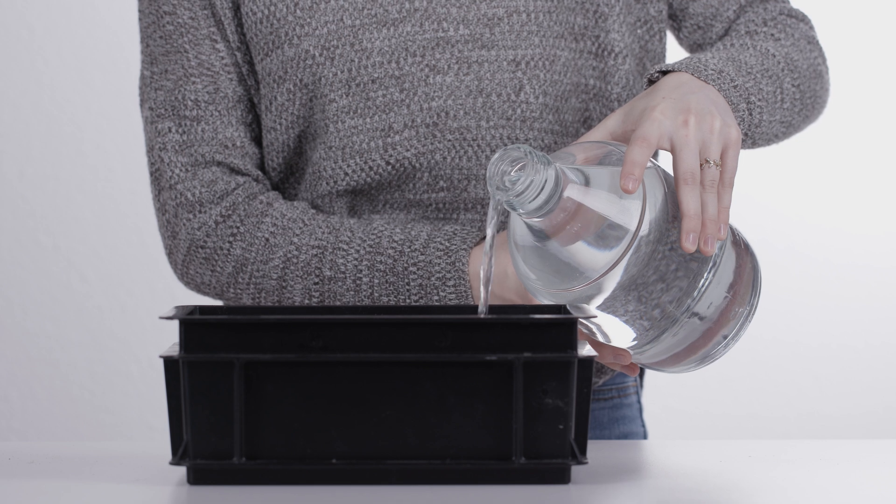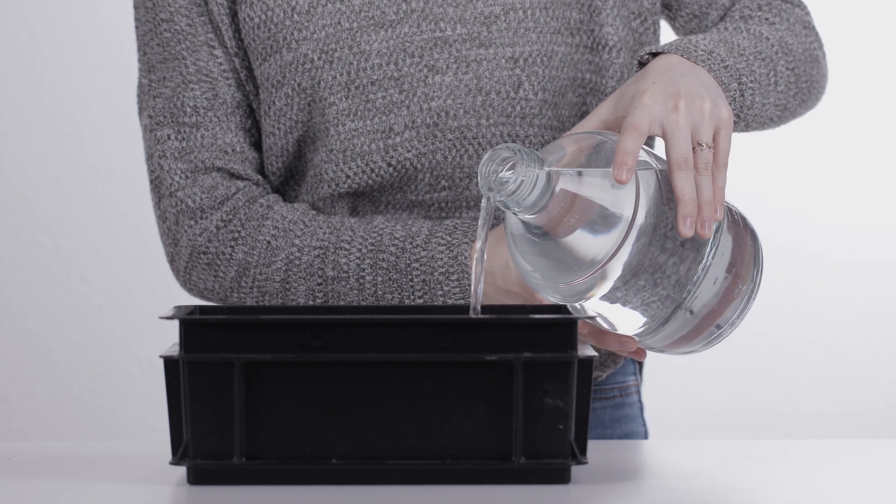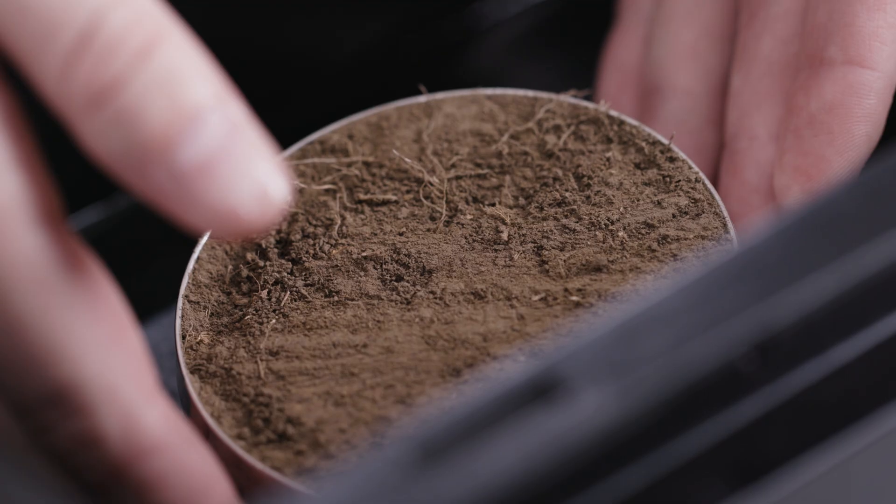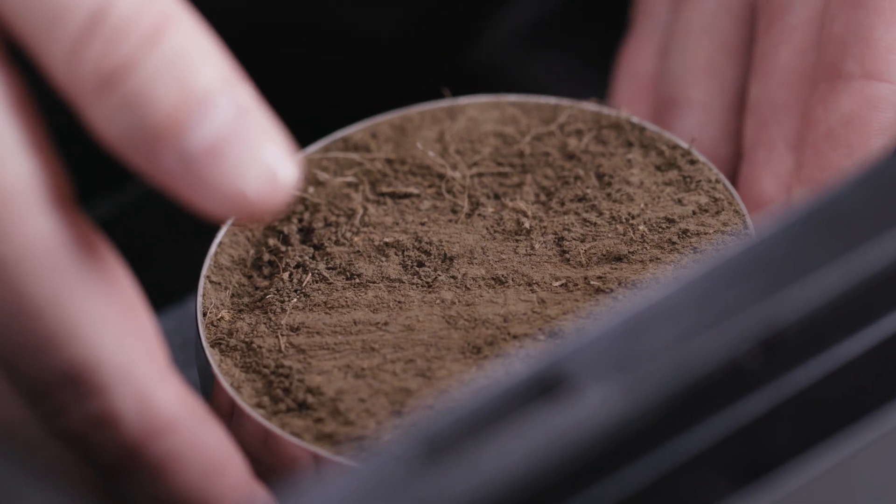Fill a container with approximately two and a half centimeters or one inch of slightly degassed water. Slightly degassed water can be produced by boiling tap water the day before. Put the soil sample into the container and tilt it so that air under the soil can escape.